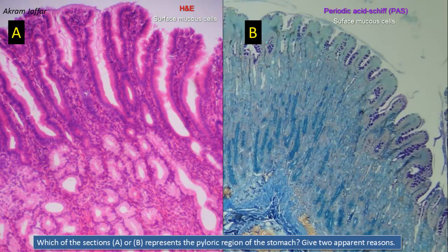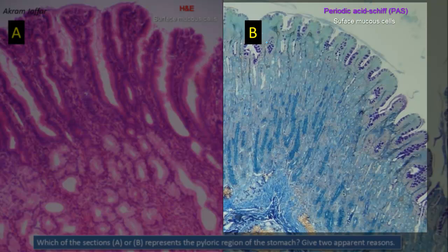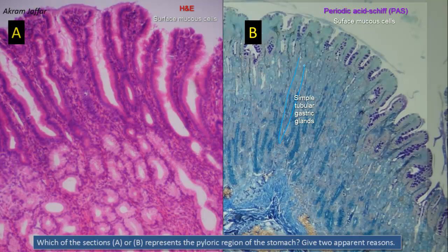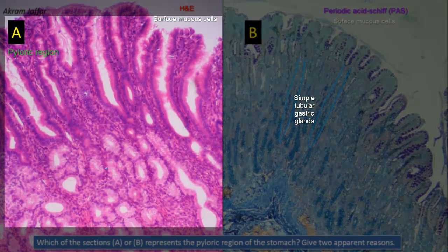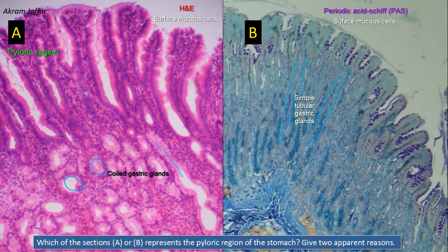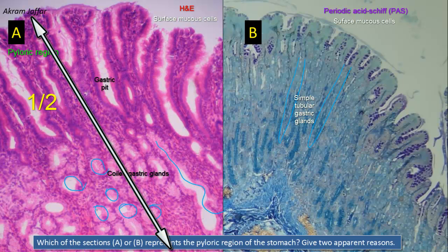Note that in contrast to the simple tubular glands of the fundus and body of the stomach, shown in B, which open into the pits as simple tubular glands, the pyloric glands in A are coiled. So they appear in different profiles — you can see how coiled they are with different profiles here. In addition, it is clear that in the pyloric region, section A, the gastric pits occupy about half the thickness of the pyloric mucosa.